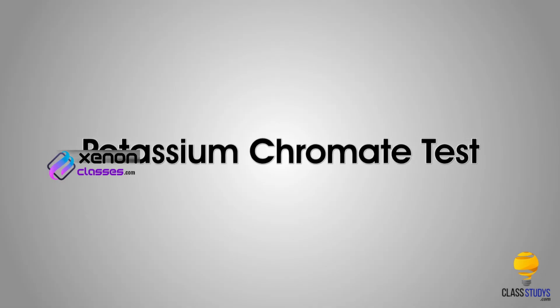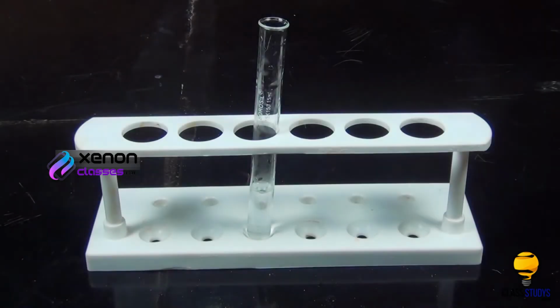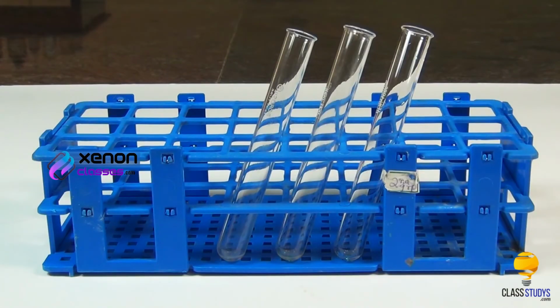Potassium chromate test. Materials required: solution obtained in the group analysis, potassium chromate, test tube, and dropper.